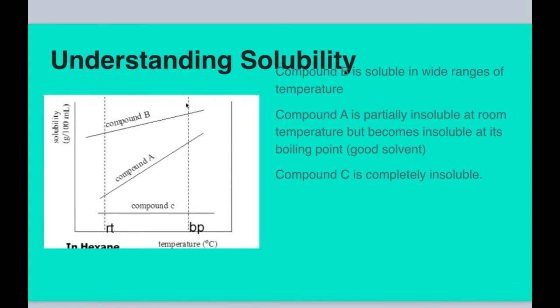That's why I was saying, instead of paying attention to hexane, I wanted to refer back to the video that we were using, which is why I said to just ignore that. Imagine compound A being the naphthalene with ethanol, and that is how we found in the video the good solvent. Yeah, what you were trying to do was right, I was trying to switch it around. Okay, I understand.